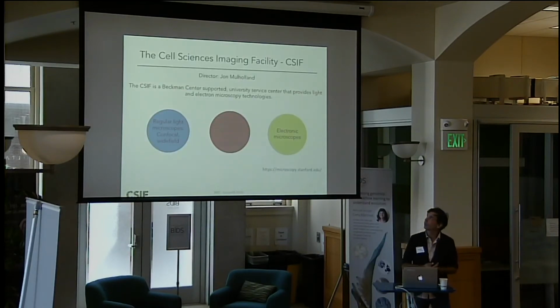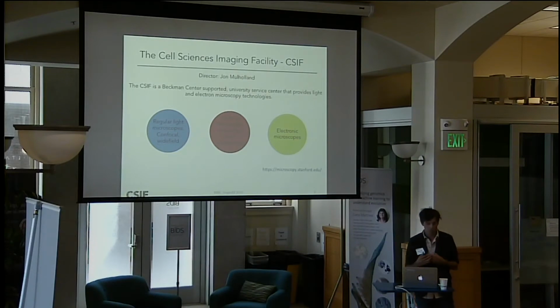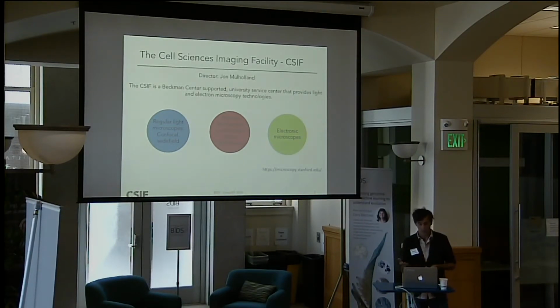It's a Beckman Center supported university service. We have light and electron microscopy technology over there. We have some regular light microscopes, such as confocal and wide field microscopes, but we also have more advanced microscopy techniques, such as the lattice light sheet. You have here a little bit of the light sheet, but it's a similar technique. We have multiplexing techniques. We can do super resolution also.